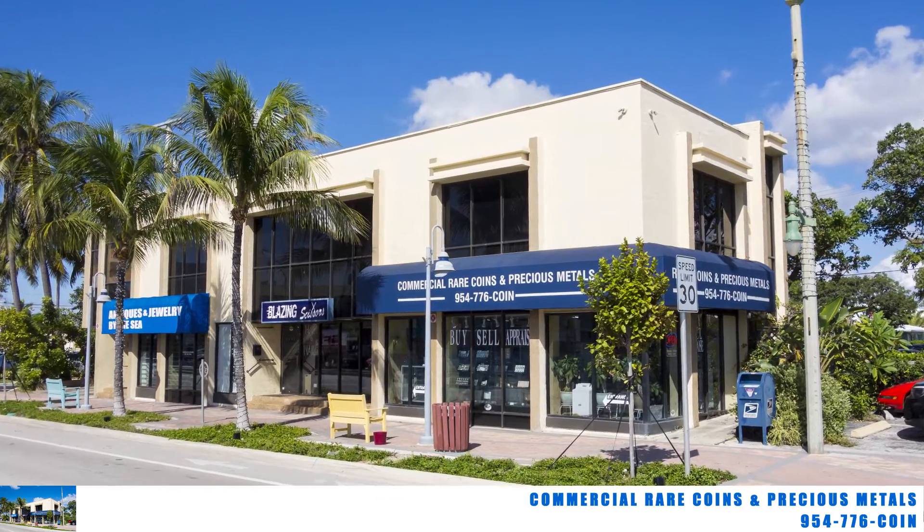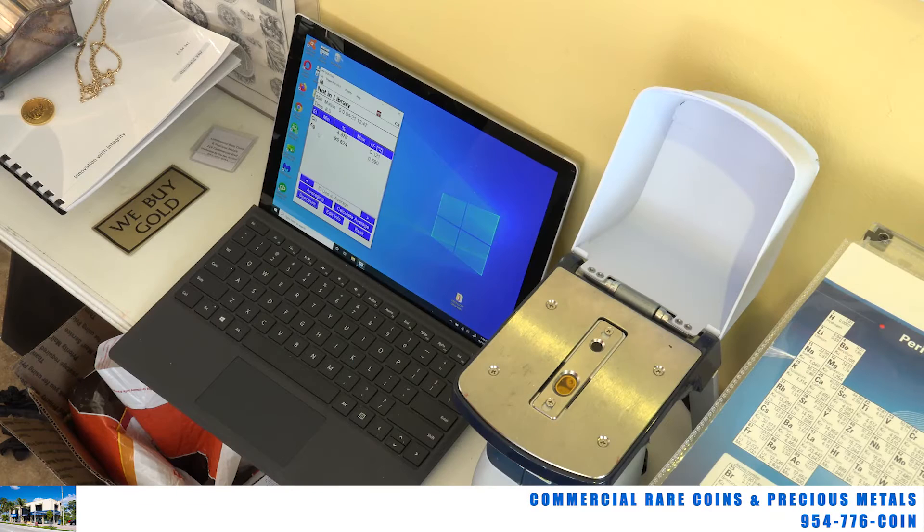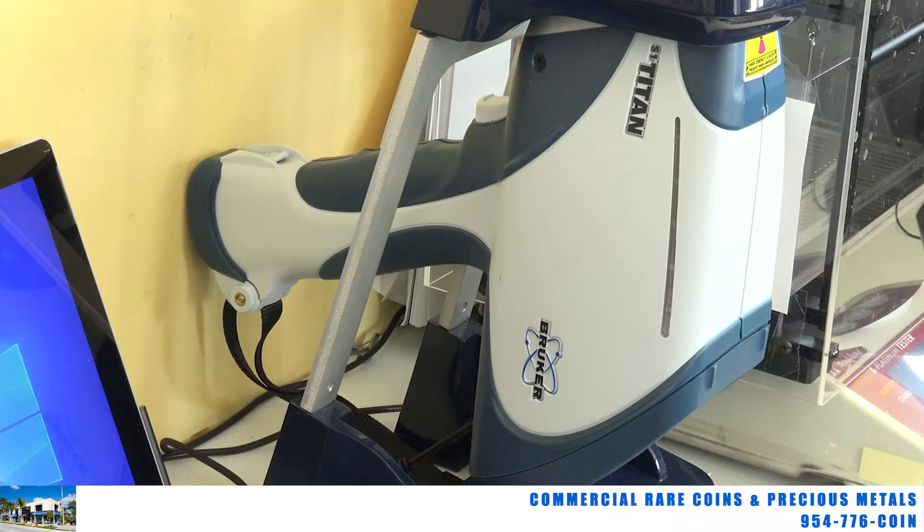Hi, this is Brian Kuzmar from Commercial Rare Coins in sunny Lauderdale by the Sea, Florida. Just a quick tutorial for you here. I think many of you have heard of the x-ray machines that most precious metals and coin dealers — or some precious metals and coin dealers — have in their shops.